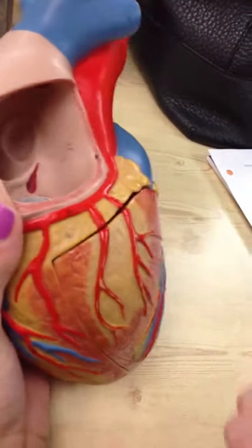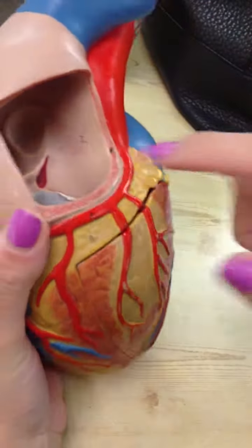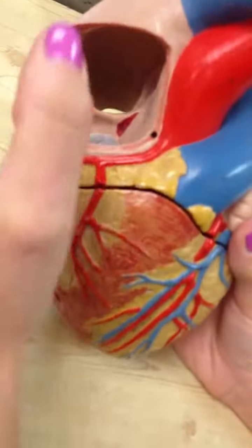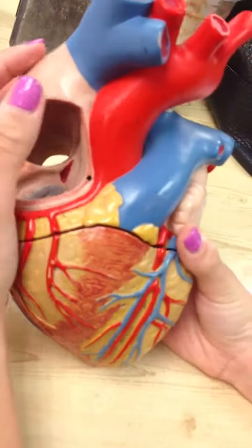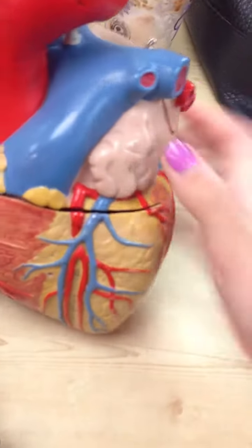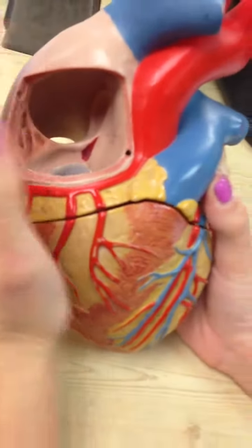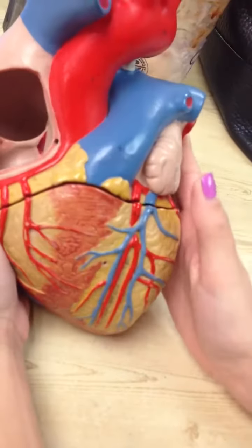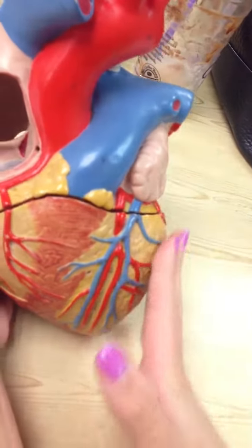Inside, we have our fossa ovalis, and right here, before the fossa ovalis, we have the interatrial septum. And then our right atrium is right here, so that means our left atrium must be on this side, inside here. It's our left atrium. Our right ventricle is going to be below our right atrium, which is on this side. And then our left ventricle is going to be below our left atrium.